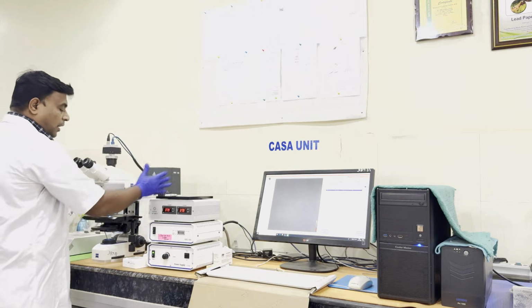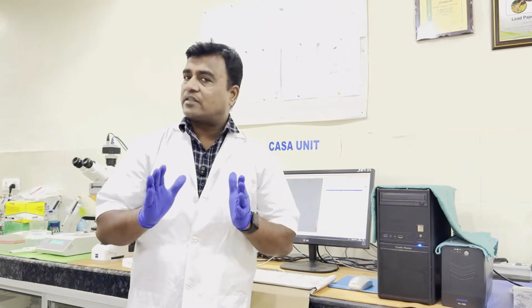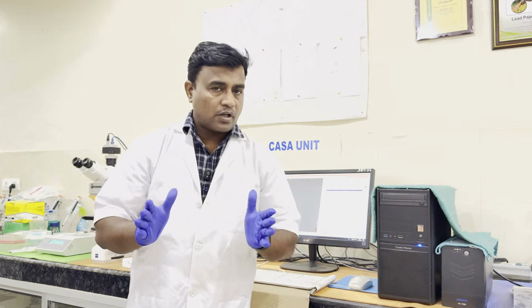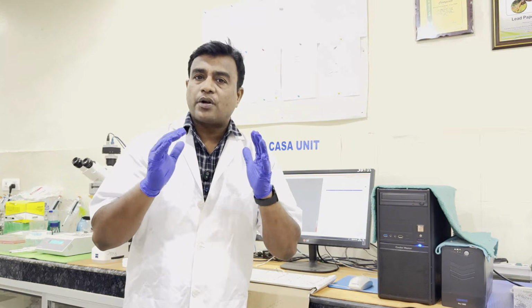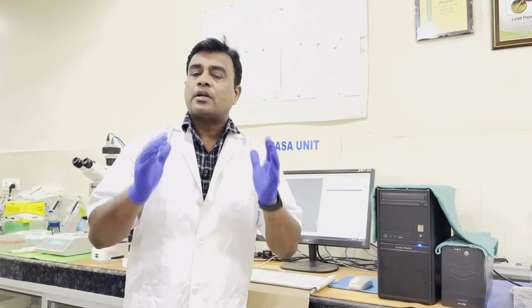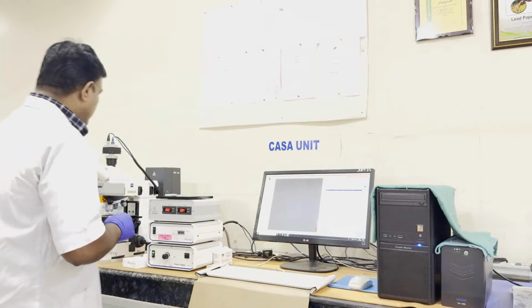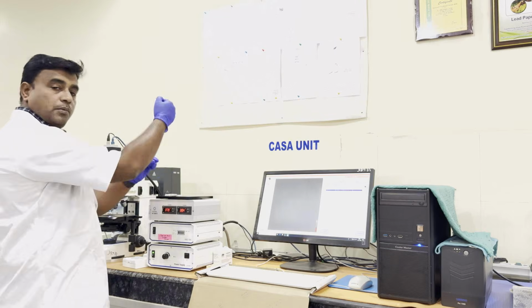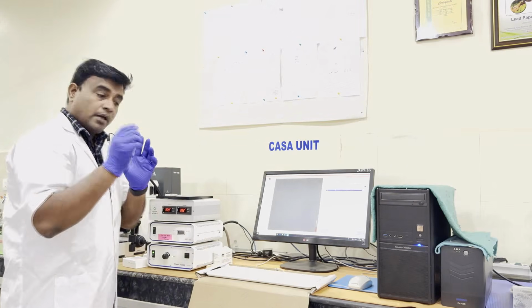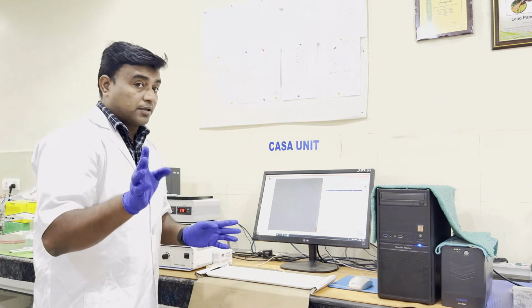Here is the total microscope setup. Usually this mini tube CASA is modified for a 20x objective and a negative phase contrast with a blue filter. And again, I am saying this varies from person to person, lab to lab, CASA to CASA, because every CASA works on a common principle but their operations are different. So here a negative phase contrast is there with a blue filter. We just load the semen in the slide and then load the slide here to go on for measurement. That is my part 3 of the lecture.